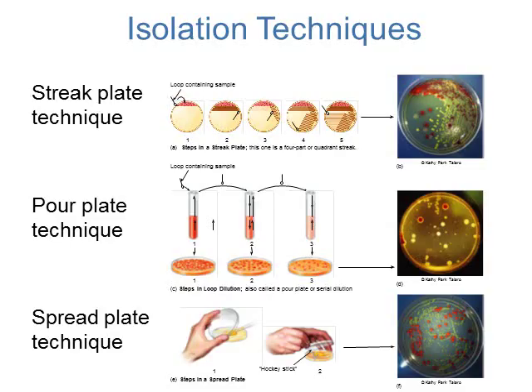So some isolation techniques, you can use something called a streak plate technique or a 4-quadrant technique, and we're going to be using this in lab, so you get to practice this. But with the streak plate technique, you take a sample, you put it in one corner of your plate, and then from that one corner you spread it out into the 2nd quadrant, the 3rd quadrant, and the 4th quadrant. And you're not adding any more bacteria to your plate, you're just spreading it out or diluting down your sample as you go around from your 1st quadrant to your 4th quadrant.